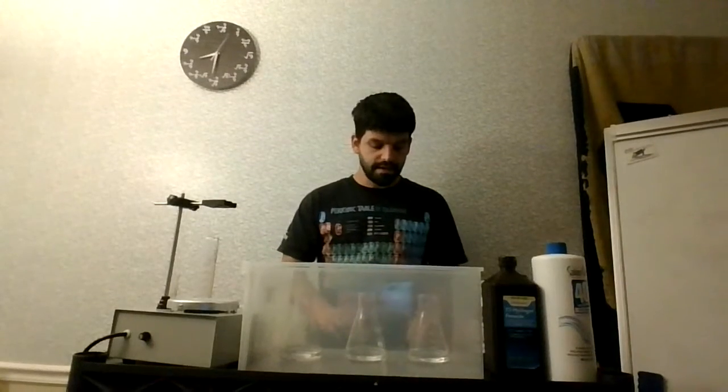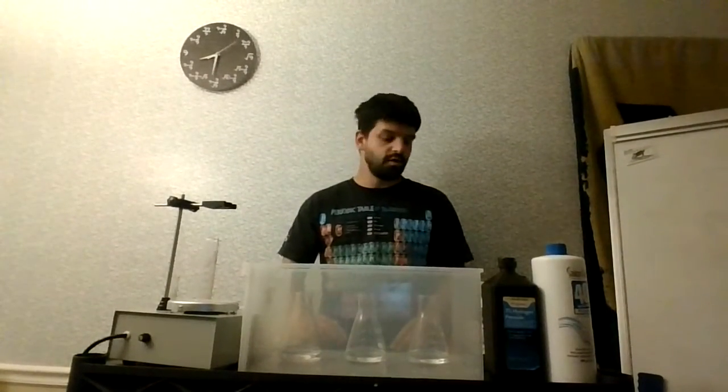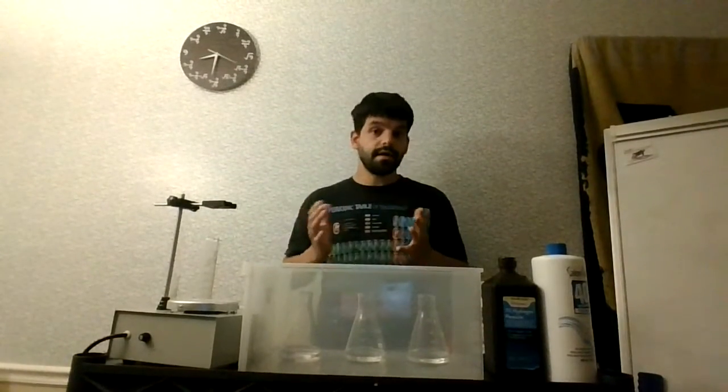So we'll take a look at that, and then some other optional things are some scissors for opening the active dry yeast, and I think that pretty much covers it. You might also want a spoon for stirring, and again, I'm going to be using my magnetic stirrer here. But let's go ahead and get started.